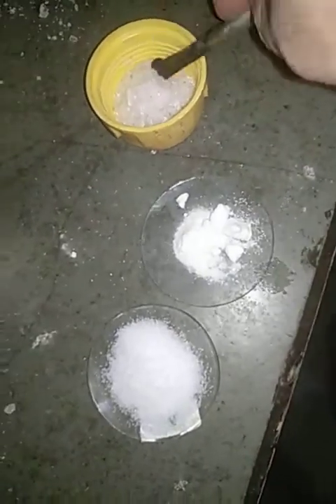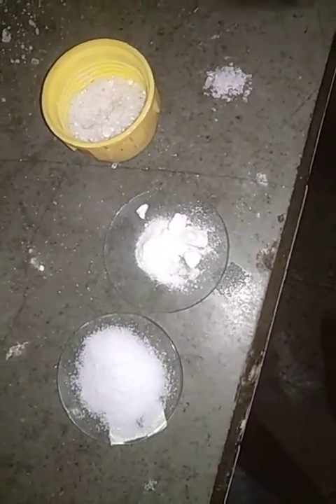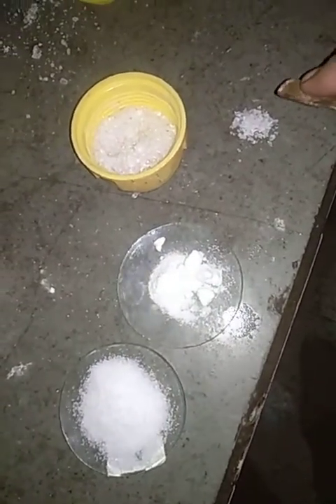So I shall take some of the barium chloride out, and then I'm going to apply pressure on this barium chloride with the help of the spatula, and let us see what happens.